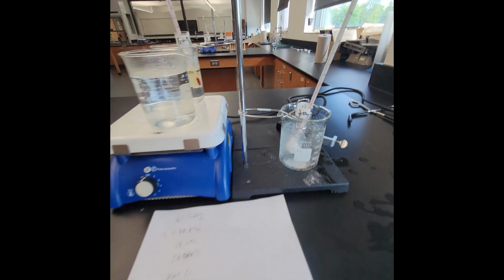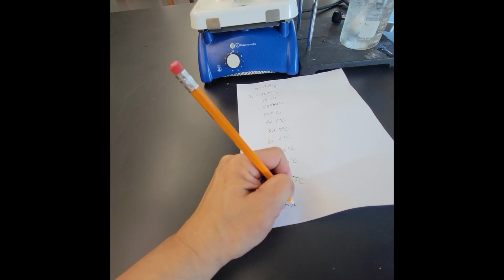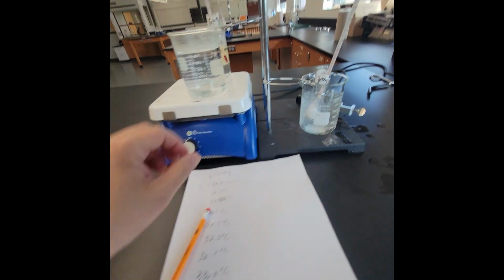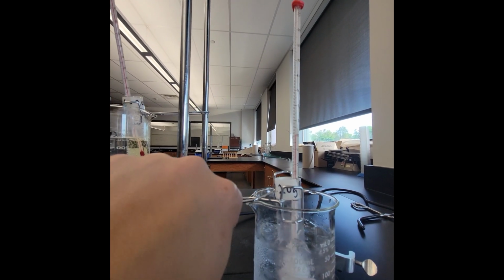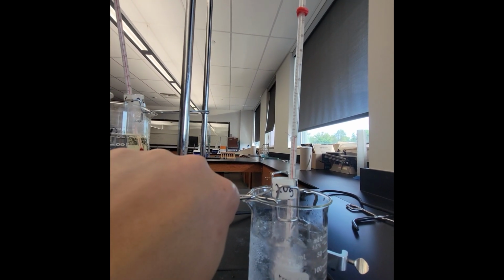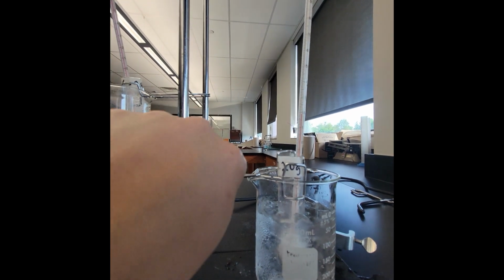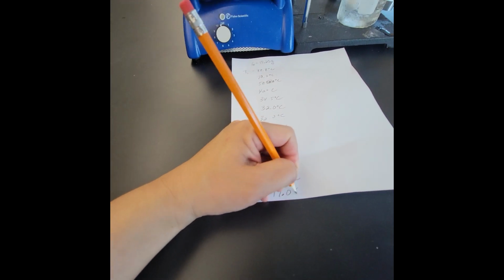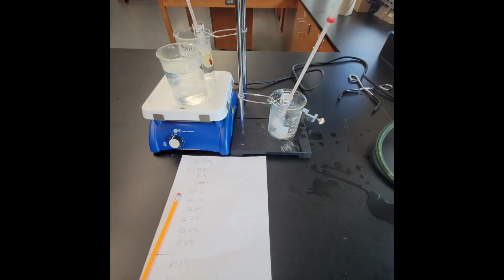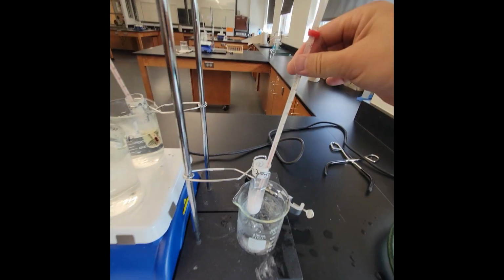23. So there was a plateau there at 33, 32, and now it's under 20. It's at 19. And it's just going to keep dropping because it is solid.